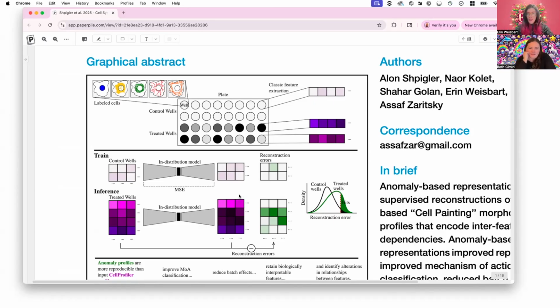And so I love this approach, because it takes something that is a limitation of deep learning models, which is that they tend to only be good at exactly what they've seen, and flips it around and says, okay, what we actually want to know is what's different. So let's take a weakness and make it a strength. That's why I love this approach. Yeah, super cool.